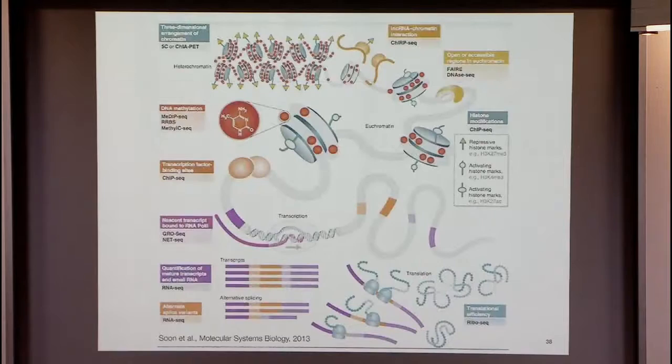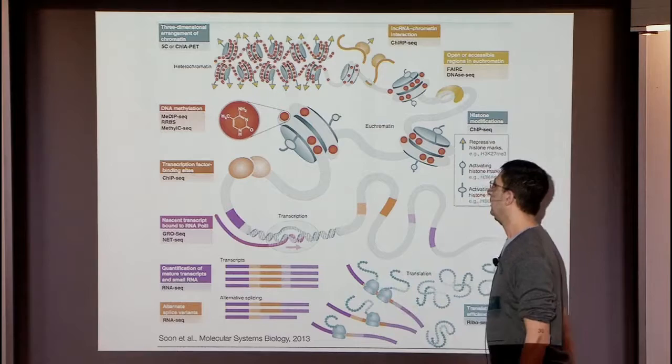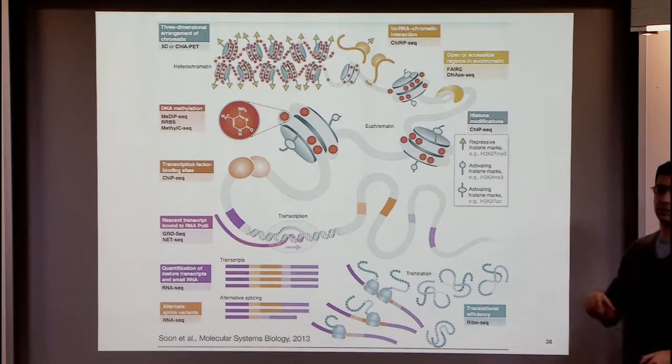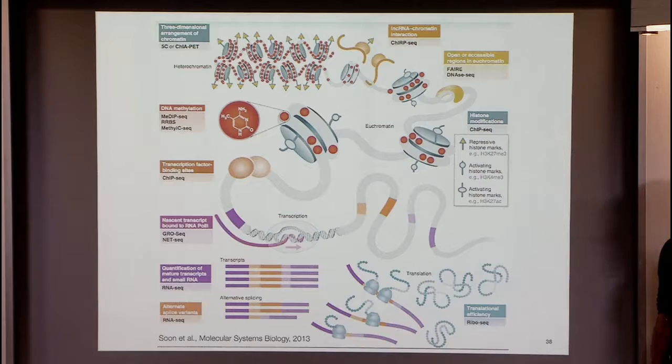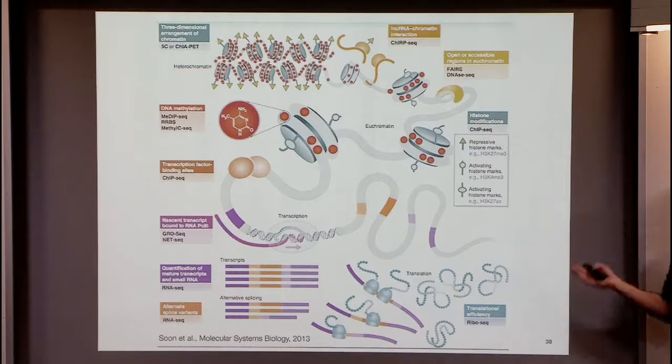And as I just said, there are now many, many such assays. I'm not going to go through them for this particular tutorial, but there are literally dozens of such assays that measure everything from the accessibility of chromatin, methylation of DNA, binding of proteins to DNA, binding of RNA to DNA, structure of RNA, translation via ribosome profiling, where the ribosomes are located on the transcripts. Just a ton of assays, and they're all about counting, and so people are all doing read alignments to do all these things.